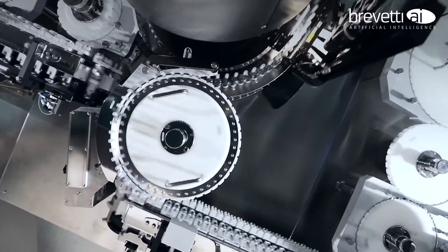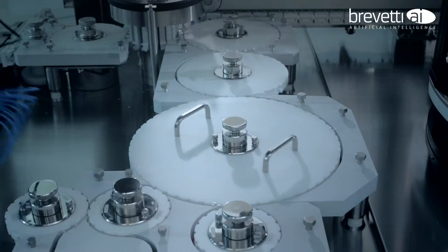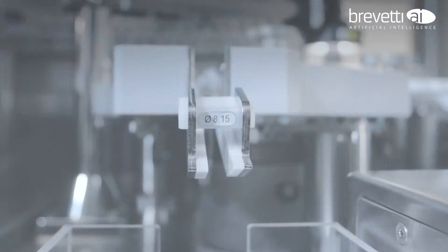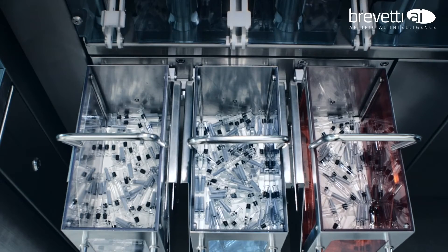Additional high resolution cameras for cosmetic inspections assure an efficient detection of defects on the finger grip, with dedicated reject channel, on the needle shield, on the plunger and of cracks all along the syringe body.